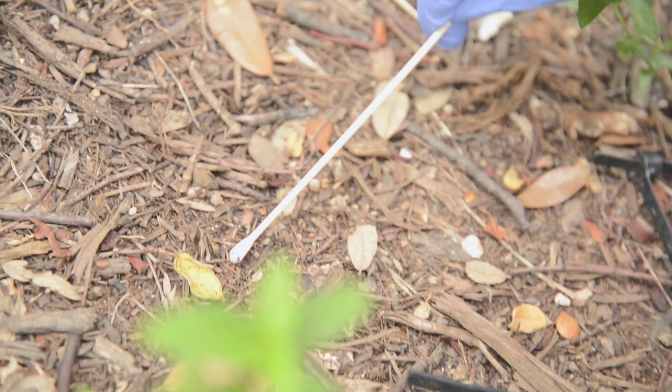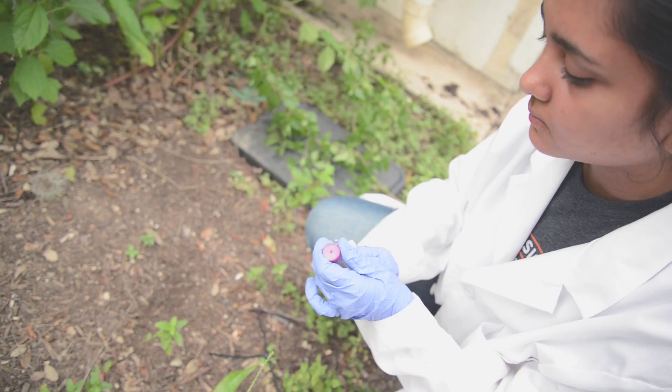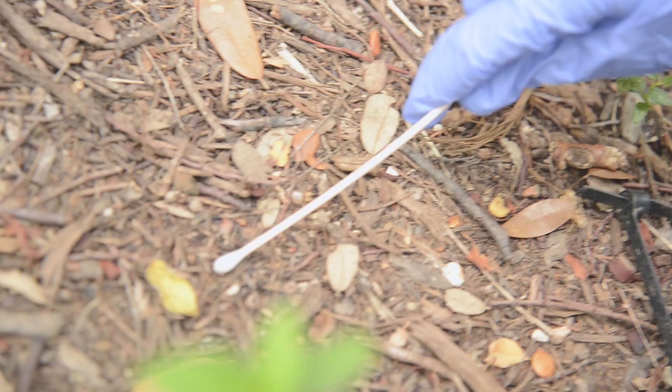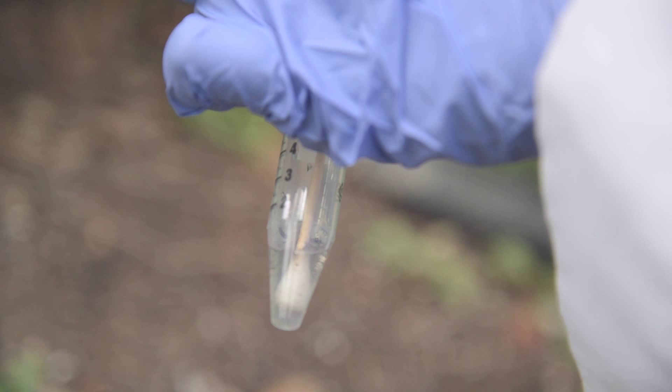We isolate bacteria from the soil right here on campus. We characterize them, figure out if they make antibiotics, and determine what species they are, or at least what species they're related to.